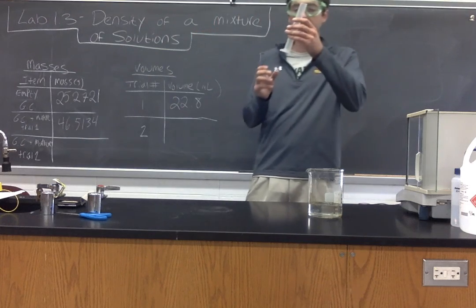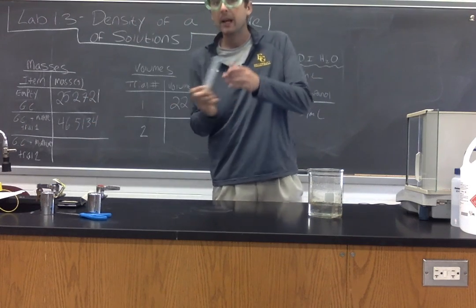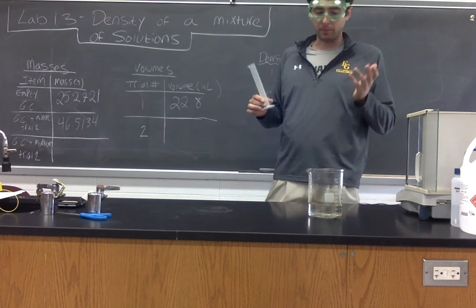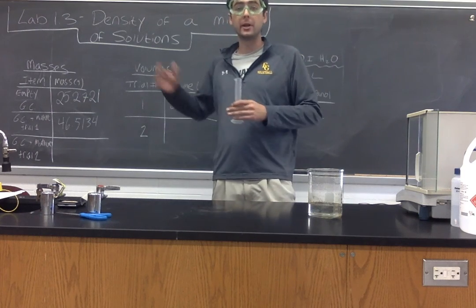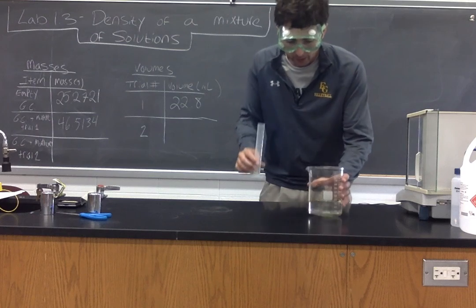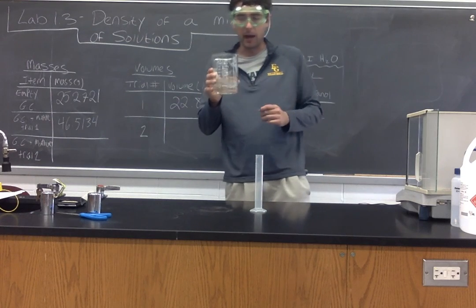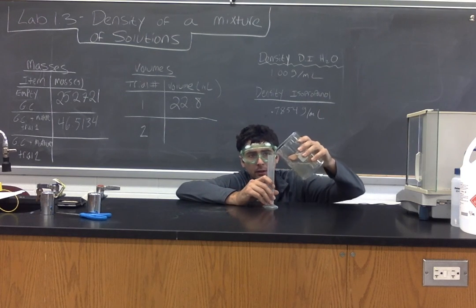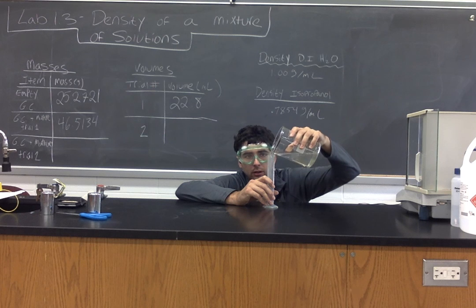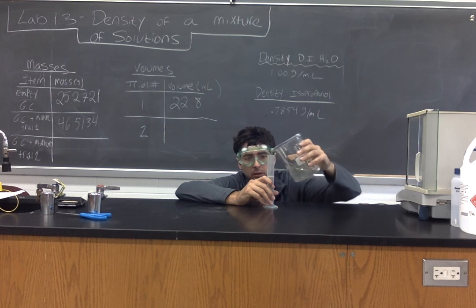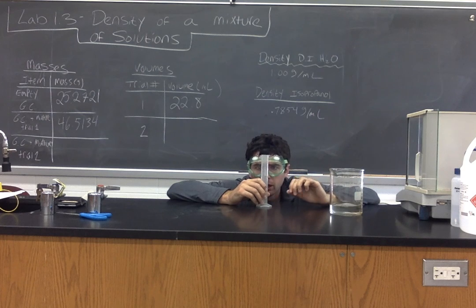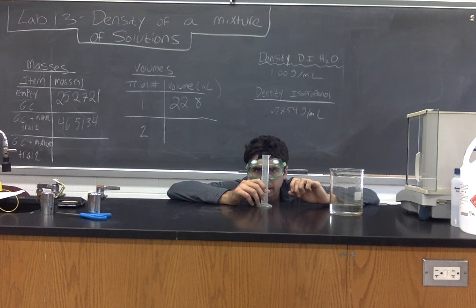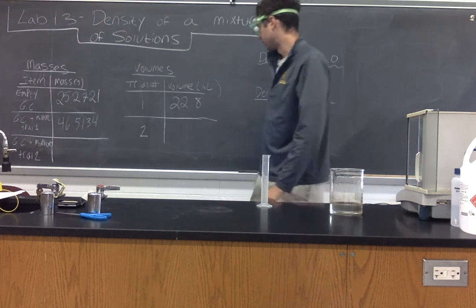Number one, it's the same graduated cylinder, so the empty mass would be the same. Number two, we're now not starting with this graduated cylinder completely dry. Despite the fact that I'm shaking it into the sink, there's still some remnants of our liquid inside of the graduated cylinder, so the initial mass would not be the same as when we measured it empty before we started here. So what I'm going to do once again is I'm going to take this mixture. I'm going to pour to a different volume this time. Let's go a little bit more than 20 milliliters.